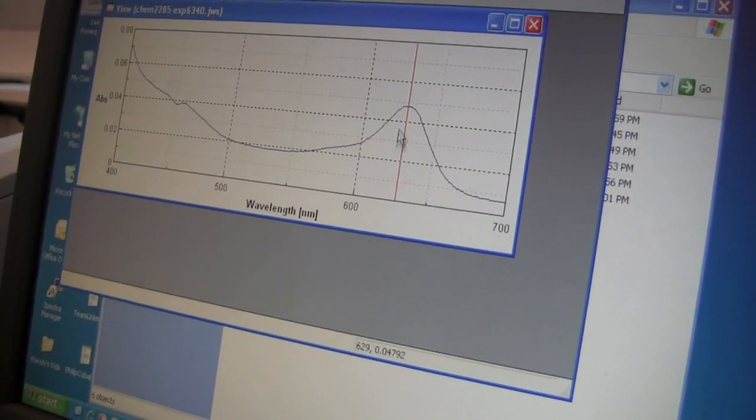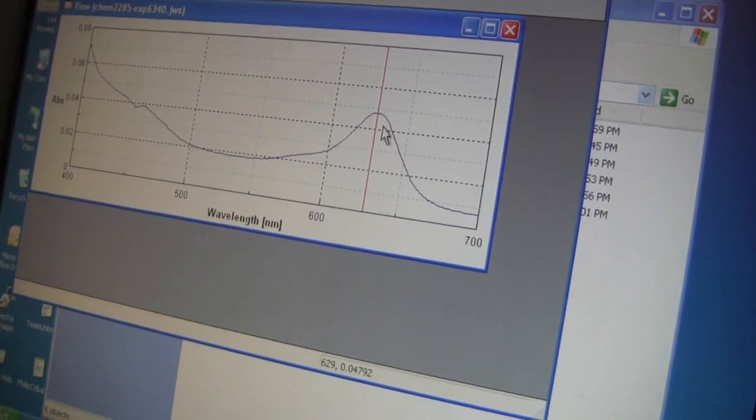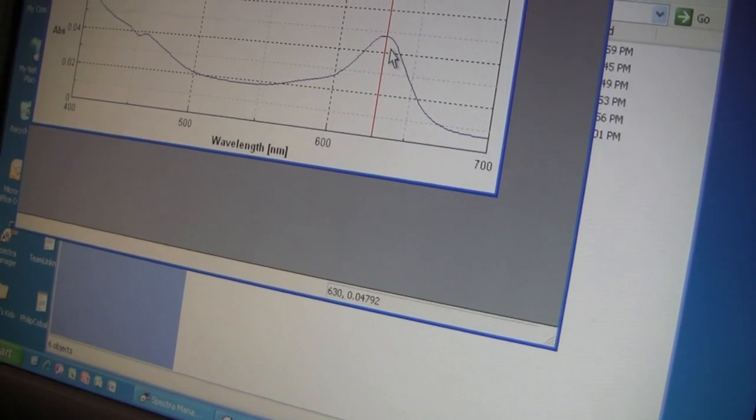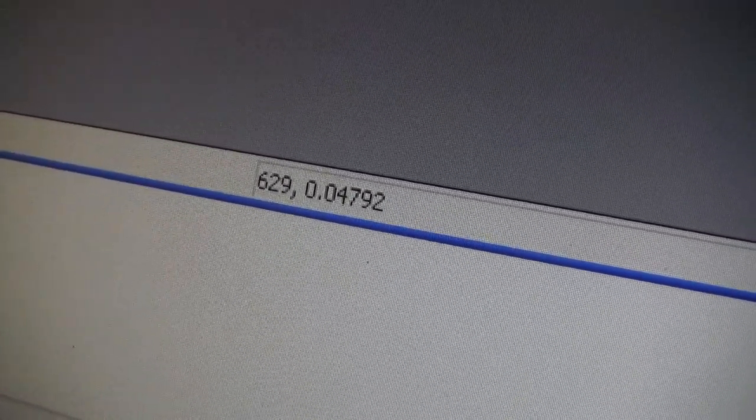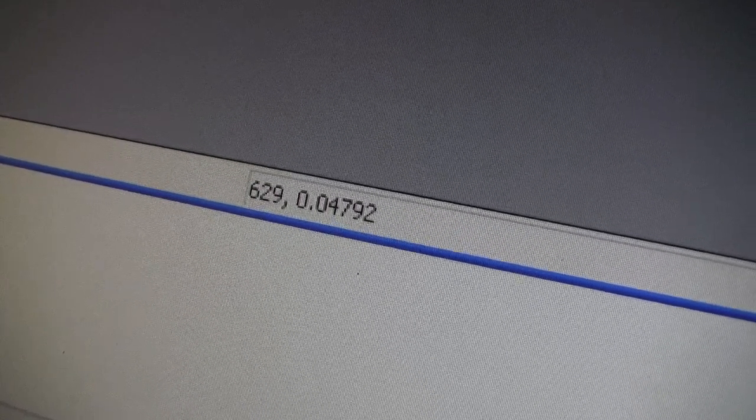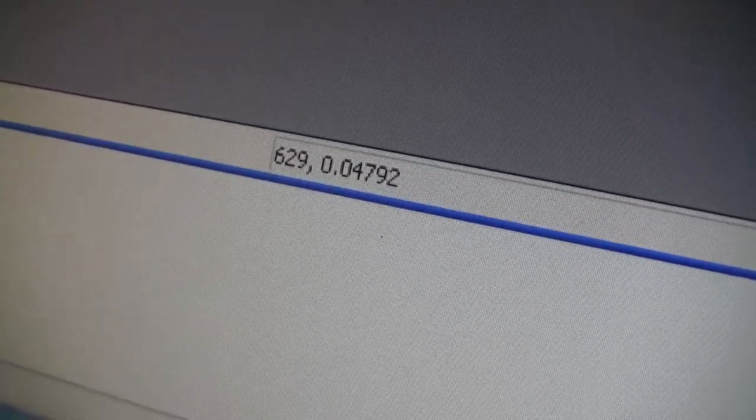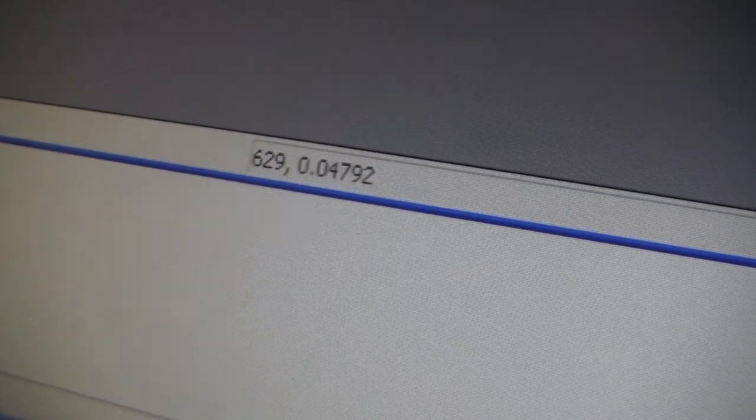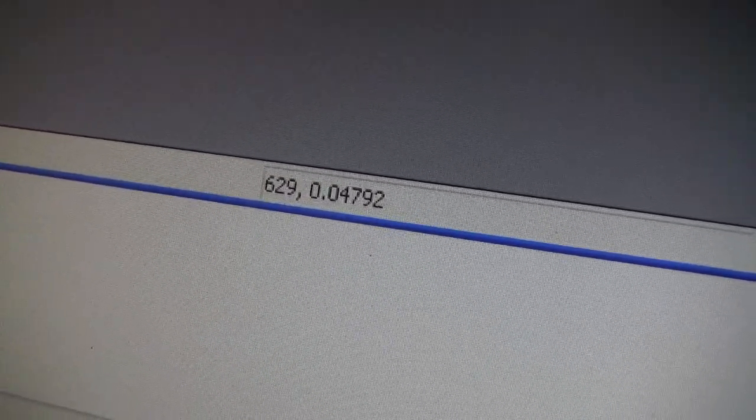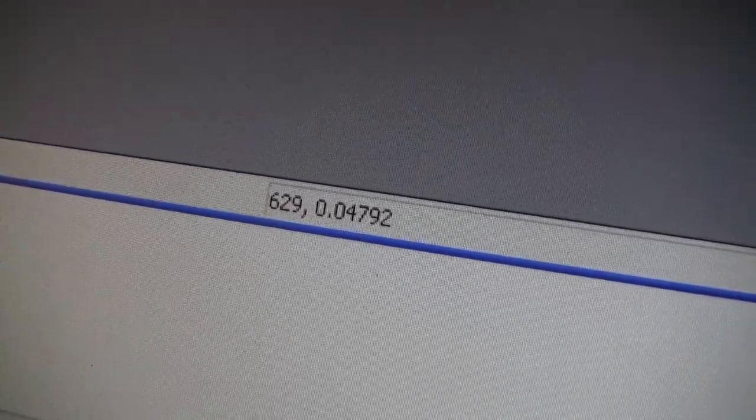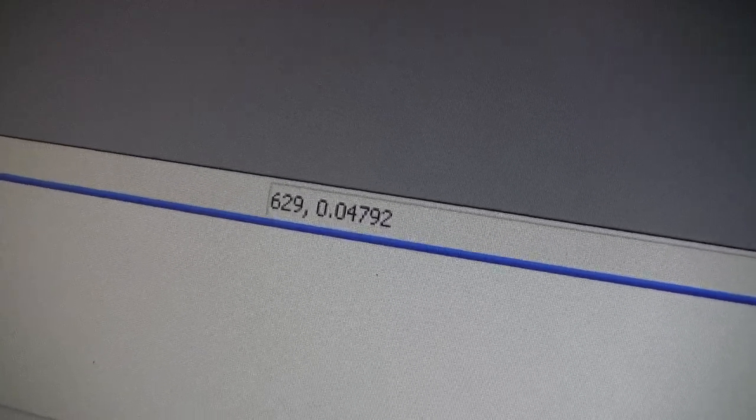Click on the highest peak, then using the left and right arrow keys, push back and forth until the absorbance, which is the number on the right, has decreasing values on both sides. Right here, the wavelength is 629 and the absorbance is 0.04792. Record these values in your lab manual.